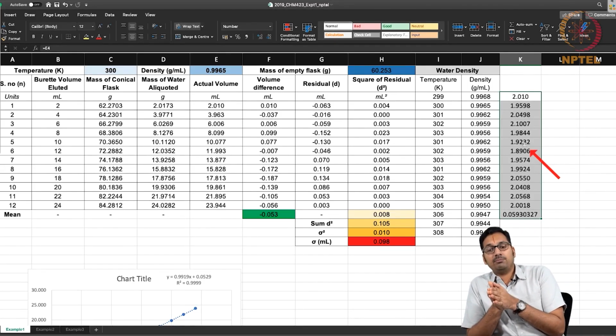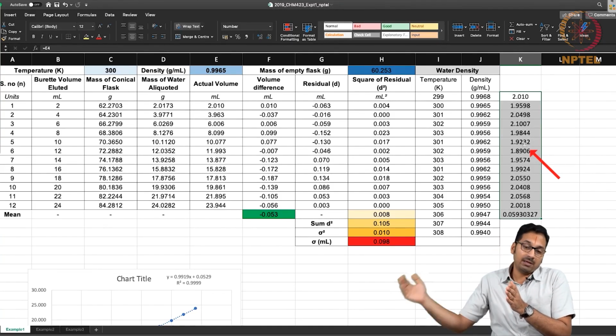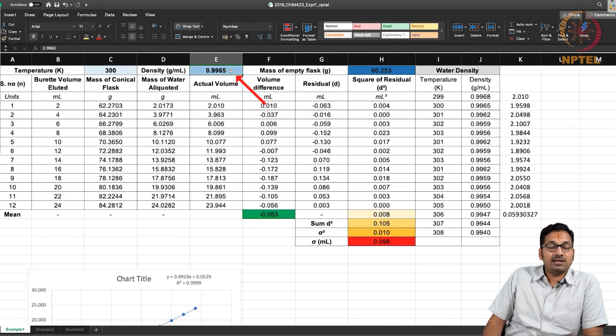This is a simple example, but as you start doing bigger experiments, larger data sets come up, and you would have to do data analysis at every step, which ends up also propagating different errors. If you remember, we learnt about what error propagation is, and those things also start coming up. In this case, where you could have an error propagation is that the density measurement is assumed to be correct until the 4th decimal.